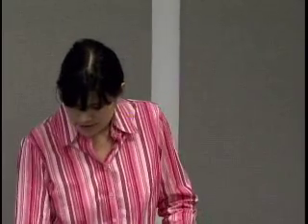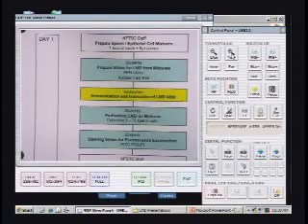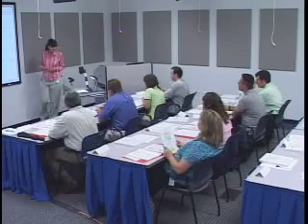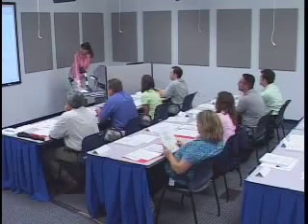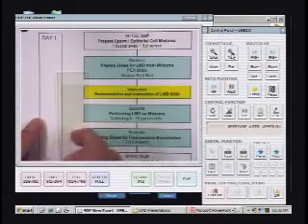Now, you students will not be preparing these first nuclear fast red slides because the first class did that for you. You will be preparing some different slides with the director slides to get a little experience with that a little later. But I just wanted to show you, does someone have one of those slides that I passed around? Yeah. So if you noticed on these slides, I don't know if you can see it on these.